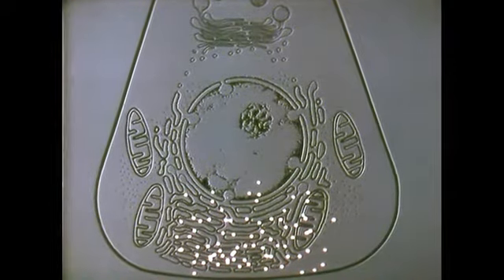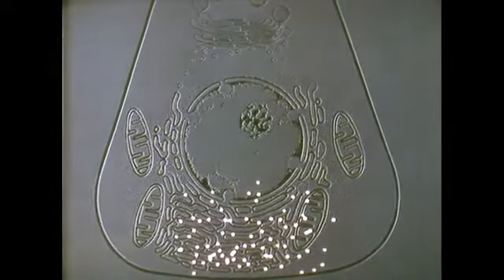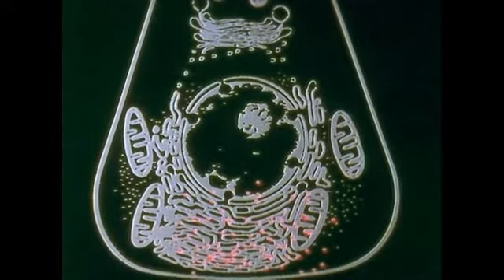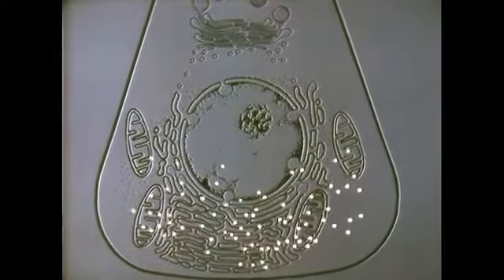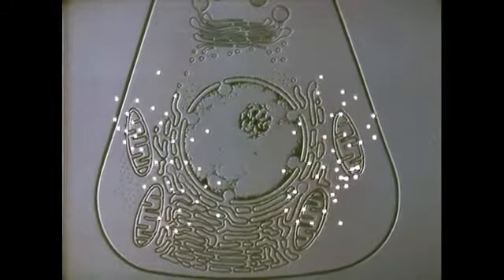After fixing and sectioning the pancreatic tissue, a photographic emulsion is spread over the grid and stuck on this glass slide for ease of handling. When radioactive particles interact with emulsion, silver grains are deposited, and it's these which indicate the position of the label. The longer the period of chase, the further will label have moved through the cell. Dr. George Palade from Yale University pioneered this work.